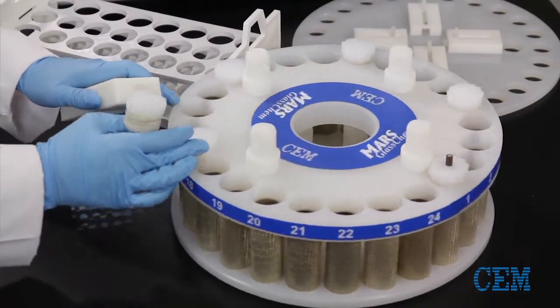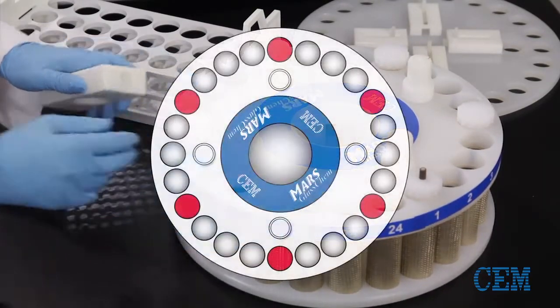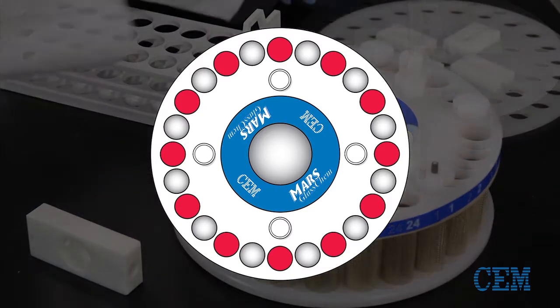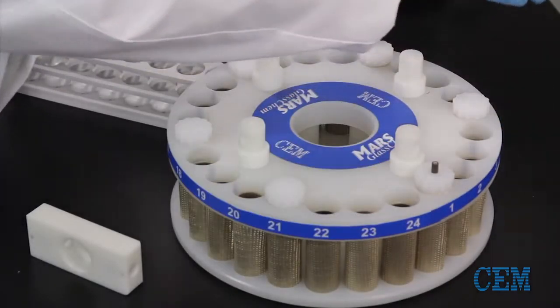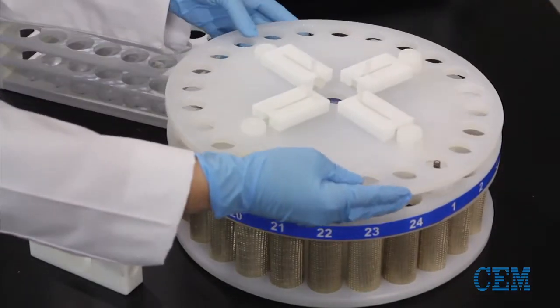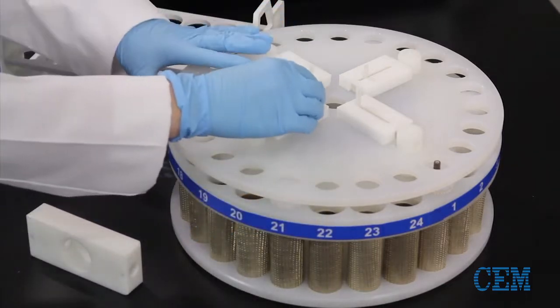Be sure that the vessels are evenly placed in the carousel as this is crucial for safety during microwave heating. Then, place the turntable shield on the carousel and engage all four pins.